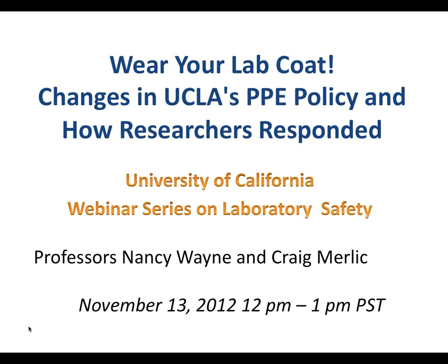Okay, you mentioned that PPE is free for employees by regulations, but noted that UCLA purchased bulk quantities of lab coats to sell. Were those lab coats sold to individuals or departments? So my department, chemistry and biochemistry, bought several hundred flame-resistant laboratory coats, and then we sell them to our stock room. And basically, researchers go to the stock room and they use their accounts to buy those, and those are grant accounts. Right. So it doesn't come out of pocket. It's a lab supply.